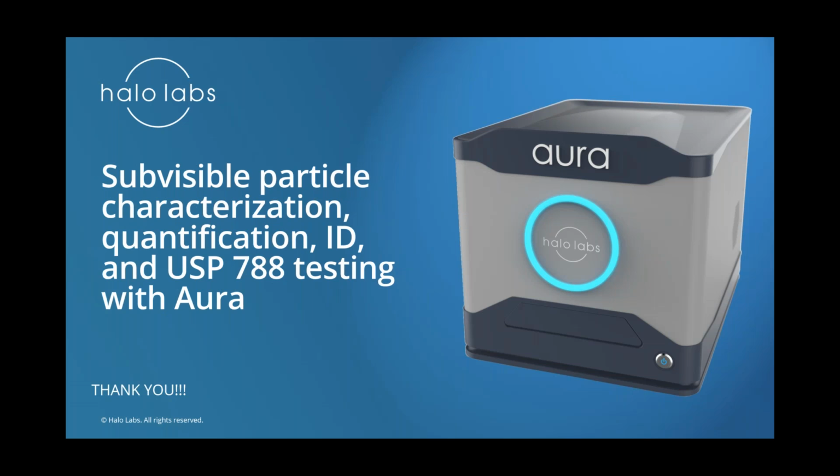And then another question just came in. Is there a maximum particle count for the Aura? I guess that goes to the linear range question. What is the end of the linear range for the Aura? We've measured concentrations up to 3 million particles per mL for very small particle sizes, so about 3 million per mL for particle sizes on the order of about 2 microns.